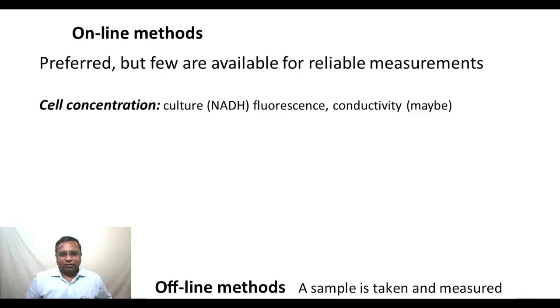the NADH fluorescence change. What is typically done is the fluorescence measurement probe is placed in a special well in the bioreactor. This is an optical probe. Before that, I need to tell you that the optimal wavelength pair for NADH is 340, 460 nanometers. So the excitation wavelength needs to come in at 340 nanometers. The emission wavelength needs to be measured at 460 nanometers. In a spectrofluorimeter, you have a nice cuvette or some other well kind of a measurement. You have a controlled way of sending in 340 and measuring it at 460.